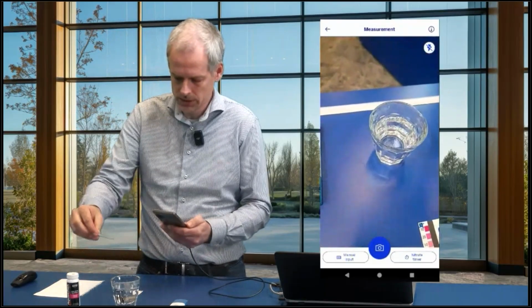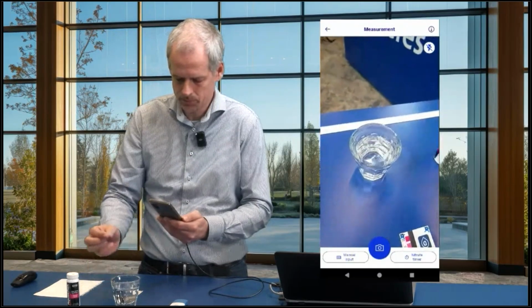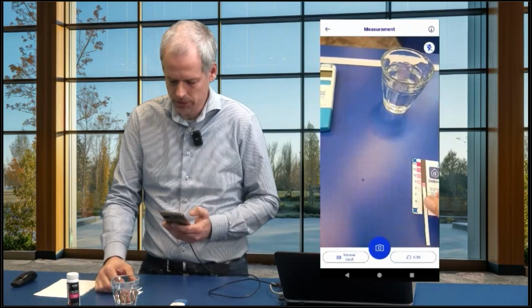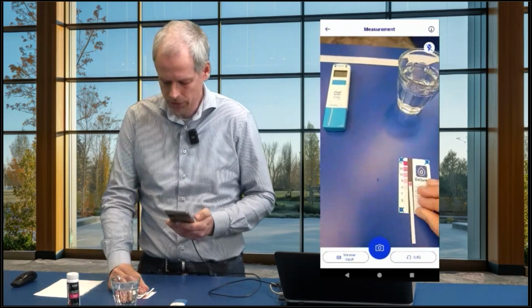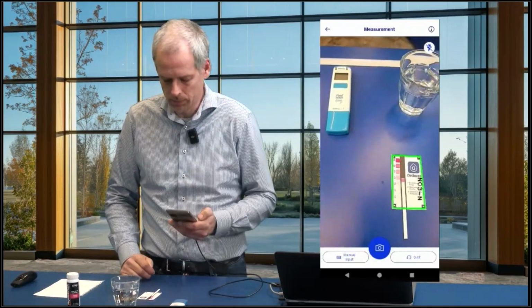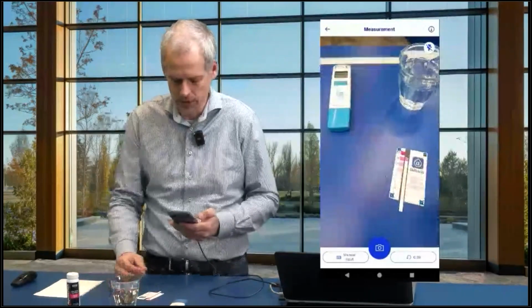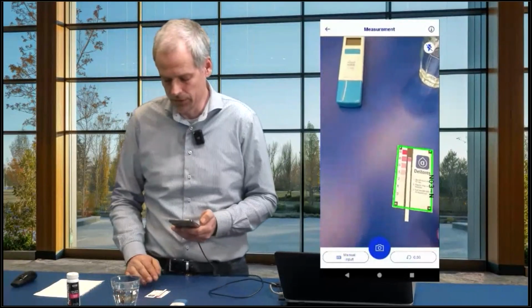Okay, there we go. So the test strip, just for 1 second in the water, and we tap it off just to get rid of the excess water. And then you can use the timer to keep track of the 1 minute. So you have plenty of time to put the strip on the reference card. We advise to already look a little bit. Okay, where do I expect the measurement value to be? It doesn't really matter where exactly the test strip is, as long as it's on the black part of the reference card.